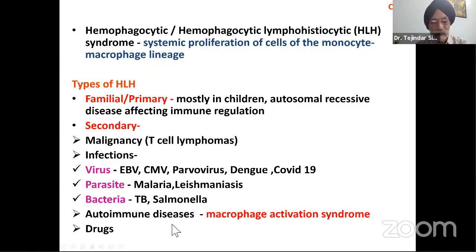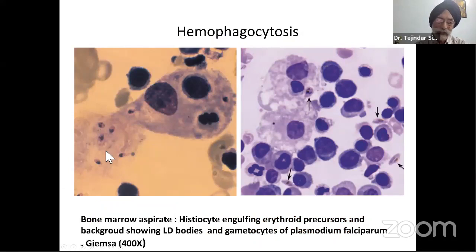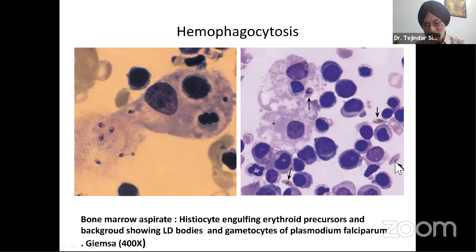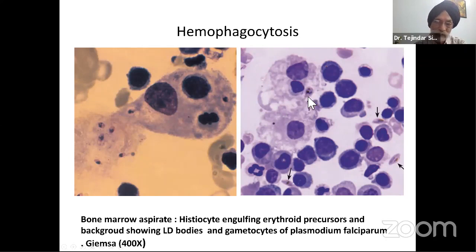Here we find a case of Kala-azar — you can see LD bodies in the macrophage, and the macrophage is also showing hemophagocytosis. There is pancytopenia in Kala-azar which is worsened by the presence of hemophagocytosis. This is a case of malaria — you can see the gametocytes of P. falciparum. Macrophages are increased and are showing not only hemophagocytosis but phagocytosis of the malarial parasite as well. So malaria also gives rise to pancytopenia and HLH.